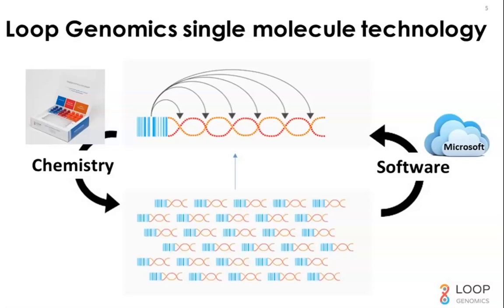Okay. How do the results of LoopSeq compare with those of other synthetic long-read methods? We're not familiar with other synthetic long-read methods that can provide full-length 16S amplicon data. I think other synthetic long-read methods provide data that's more similar to shotgun metagenomics or whole genome sequencing.